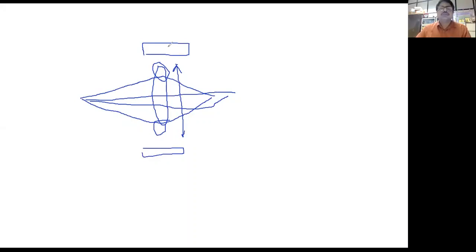And these are electromagnetic lenses. These are not superconducting lenses. That's the future of the microscope, whether you can miniaturize them. These lenses are horrible actually. Suppose you take a microscope as a black box. Just forget about what is inside.